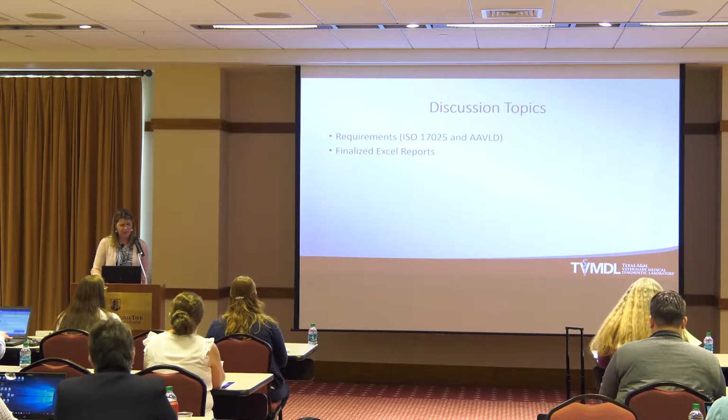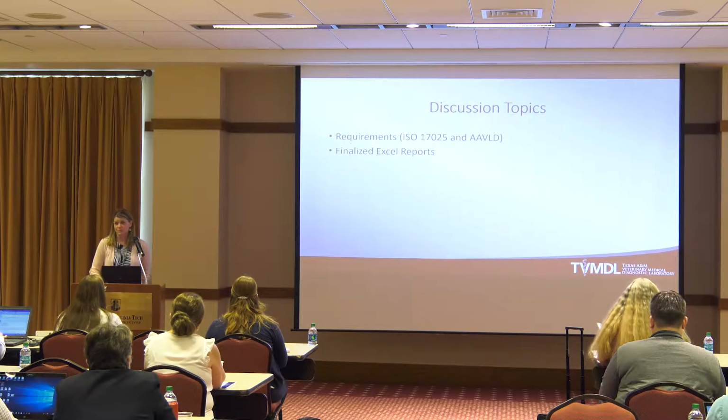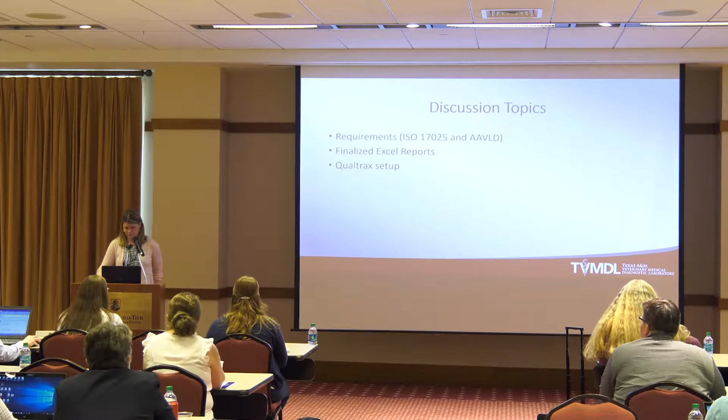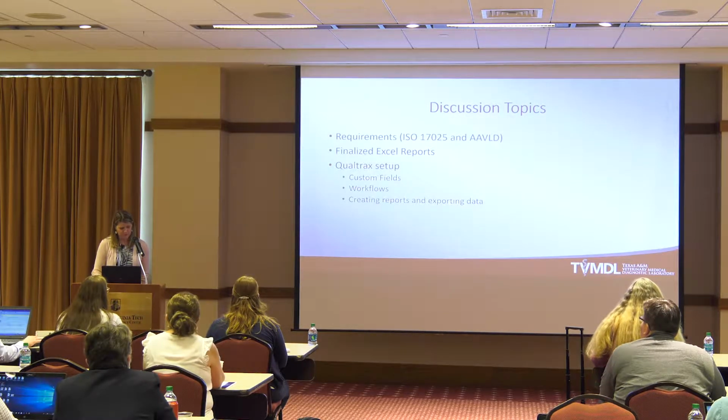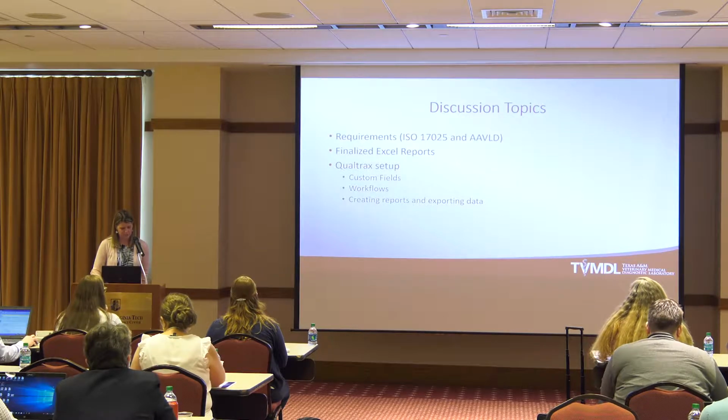And then we're going to show you some finalized Excel reports. So we put our data into Qualtrax. Then we get it out of Qualtrax and we put it into Excel. And we'll show you how we do that and how we set up Qualtrax and all of our workflows to meet those needs and those requirements. So we have custom fields. We have shared custom fields across multiple workflows. That's how we accomplish this.